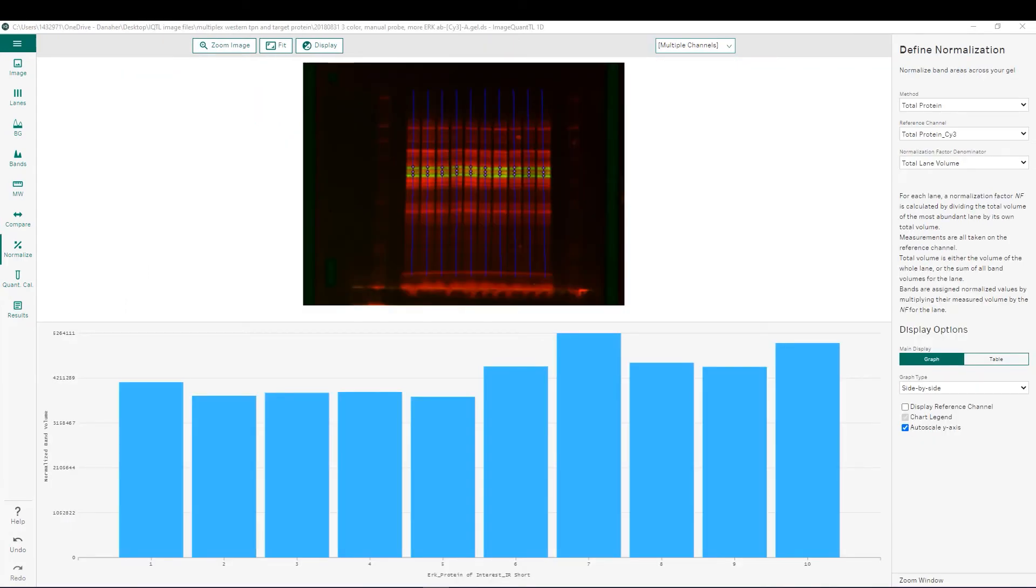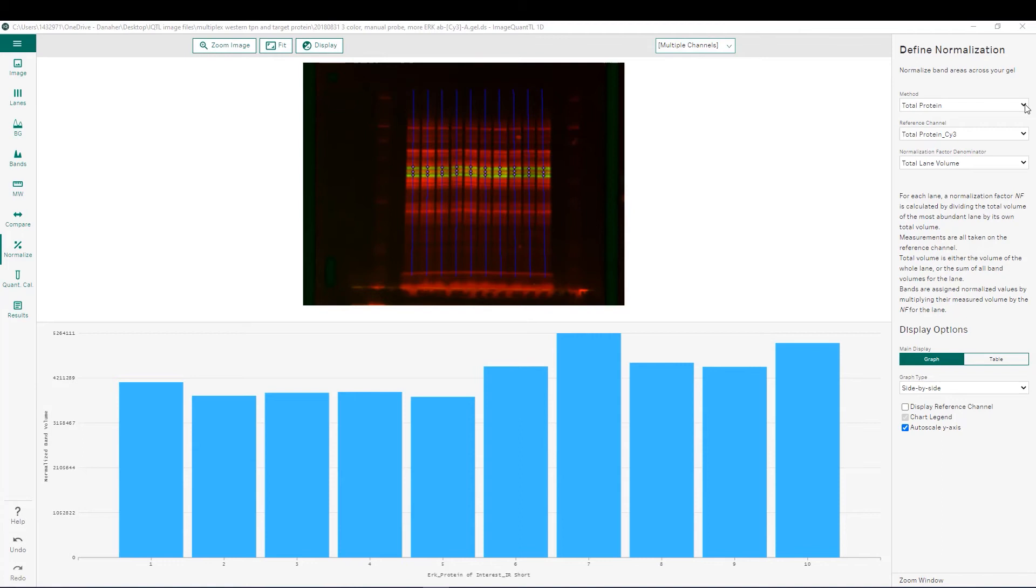Here we are showing the normalization function in ImageQuantTL version 10. We have drastically simplified this process from previous versions of IQTL. Once you get to this step you simply have to choose which method for normalization you would like to use.